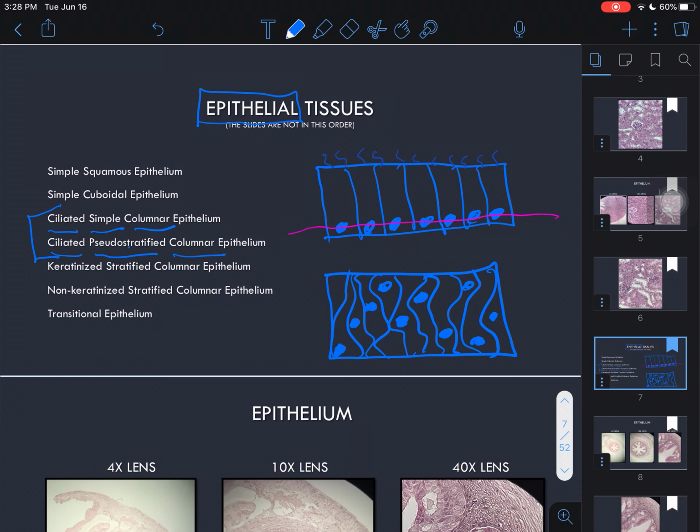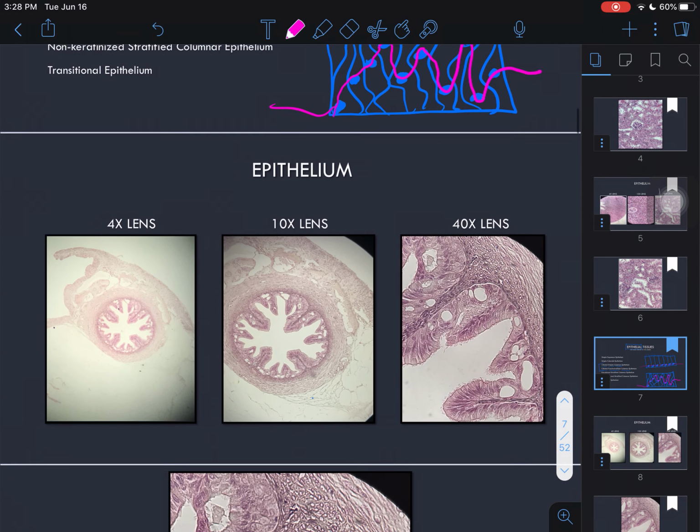So that it looks like it's more than one layer, but as you saw me draw out the cell membranes, right? There's only one in that one section, but they're so squished together they push up and down, and you can no longer draw that straight, pretty line through the nuclei, which makes it look like there is more than one layer, but there's not.